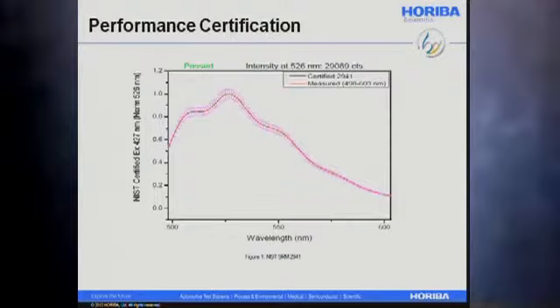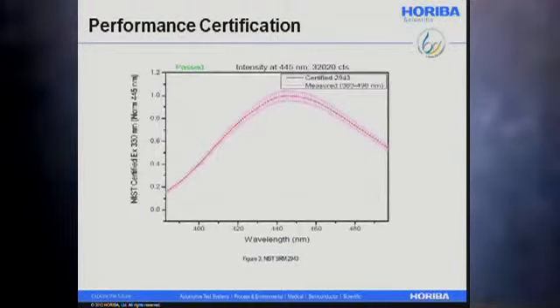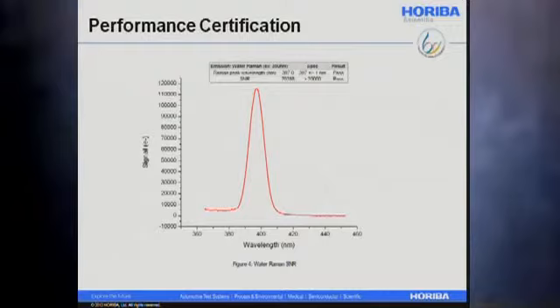So this basically illustrates the interlaboratory comparison validation test for the system, comparing to NIST-traceable reference materials of fluorescence in the ultraviolet and the blue-green. The red line is the actual instrument performance, and the allowed error bars from the NIST certificates are shown in the error bars there. And again, there's throughput monitoring, so on a day-to-day basis you can monitor the throughput and validate the instrument signal and signal-to-noise ratio.